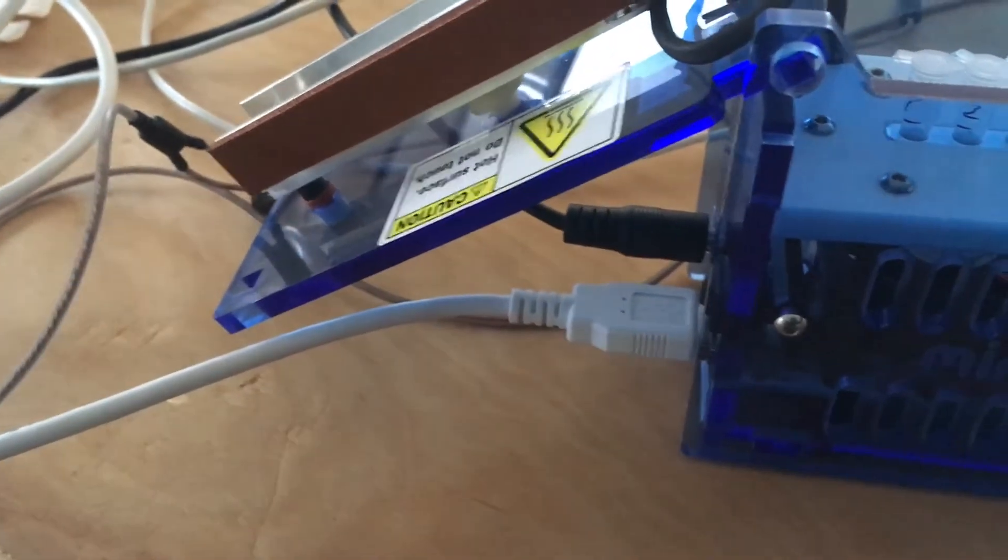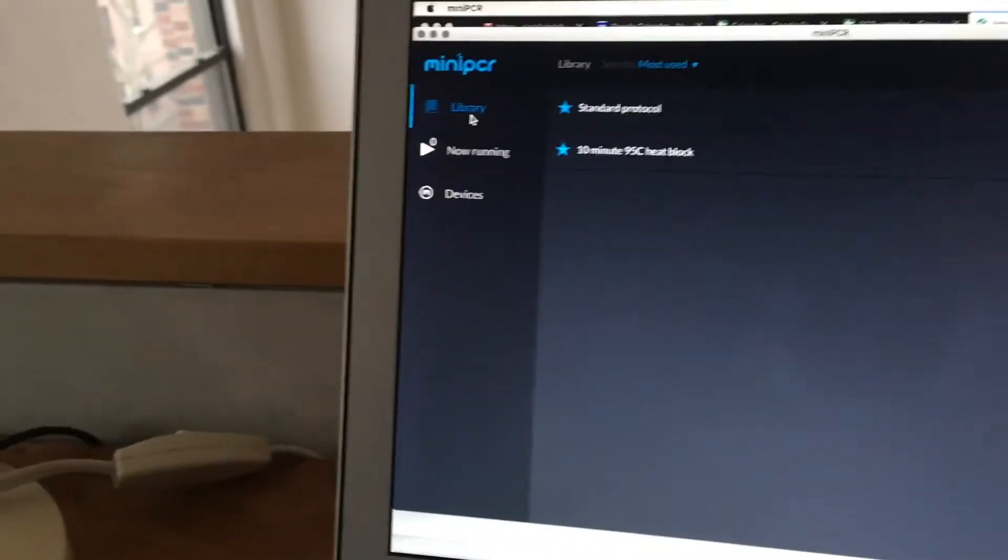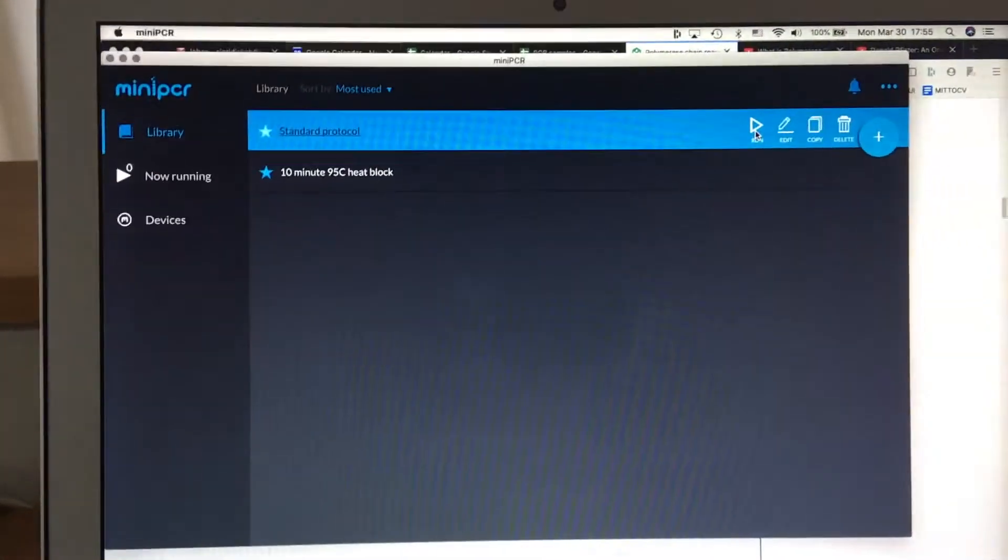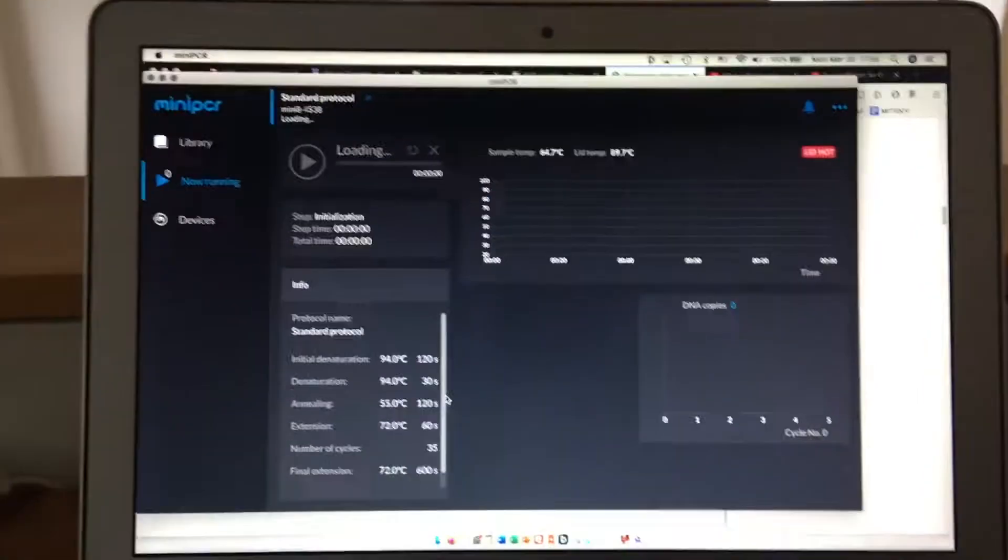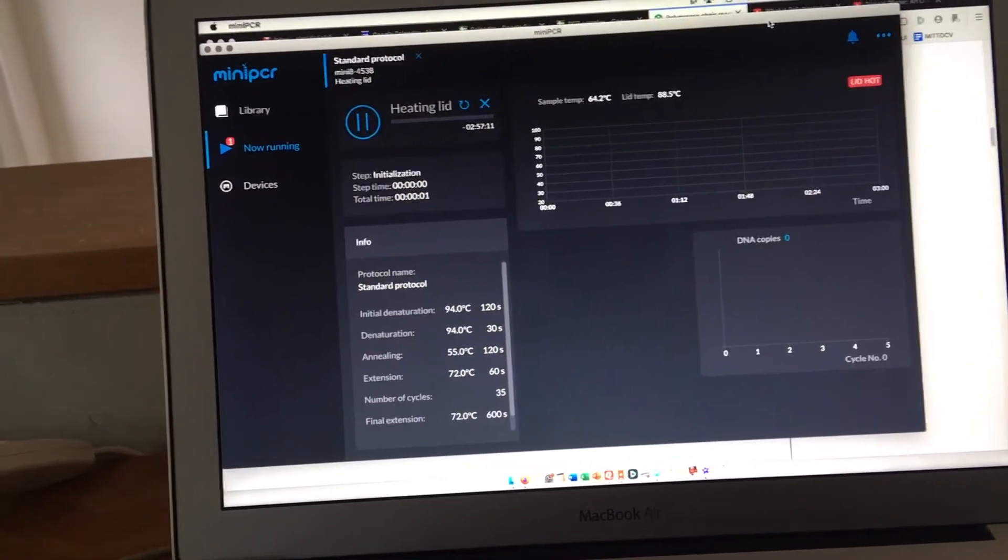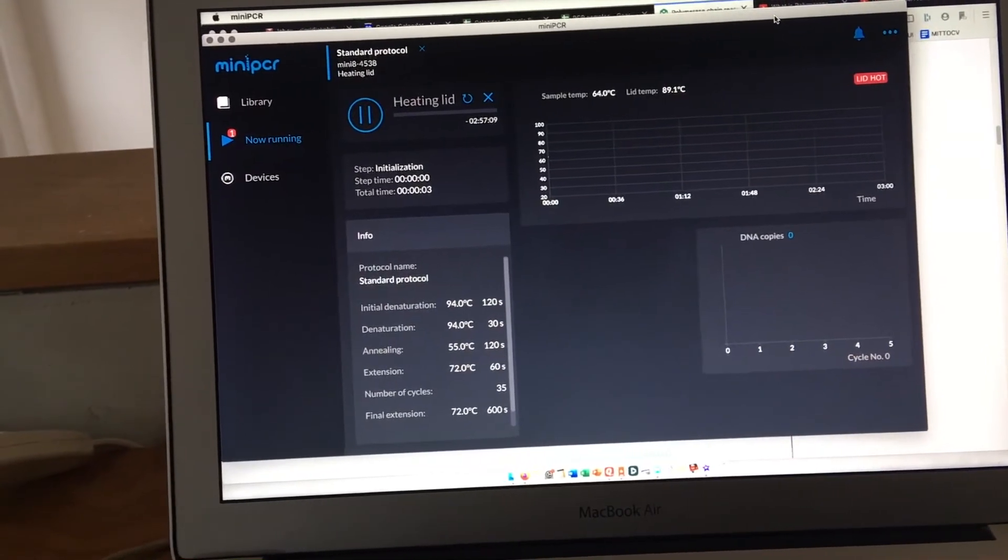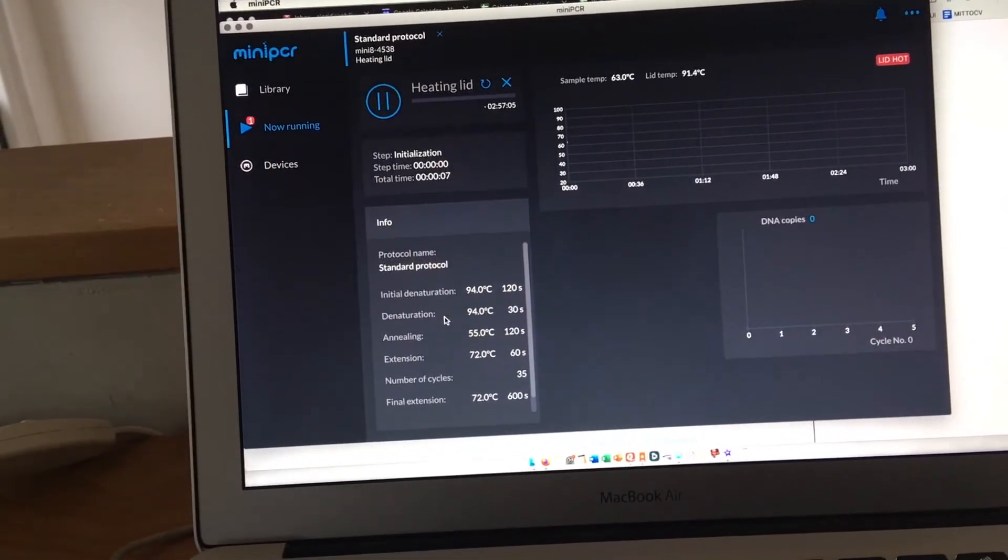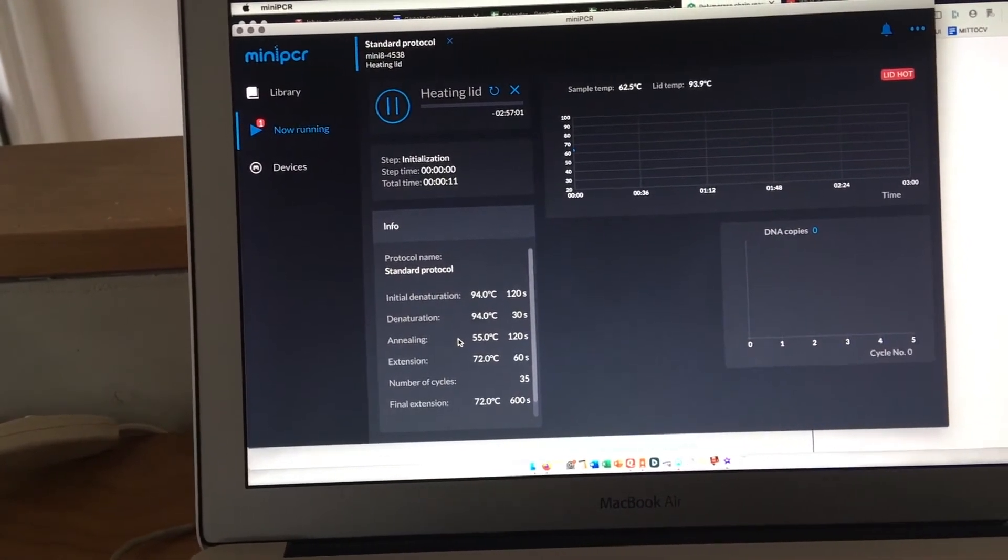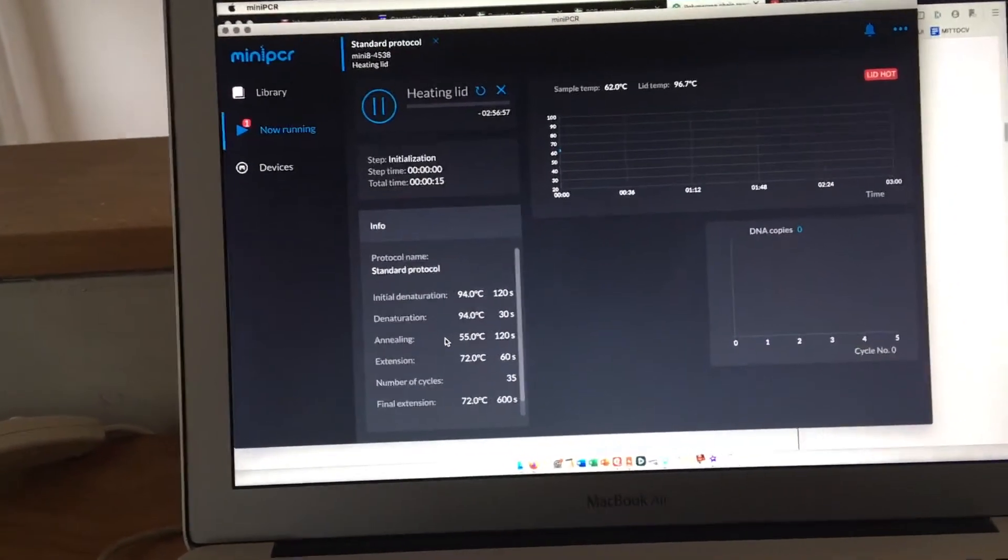We're going to close it, and then we're going to go to the library here. This is my interface, and I've got the standard protocol here, and I'm just going to run that protocol. This shows you what's part of the protocol. There's going to be an initial DNA denaturation where they're going to try and split the DNA, then the denaturation and then the annealing where the primers bind to the ends of the uncoupled strands of DNA.